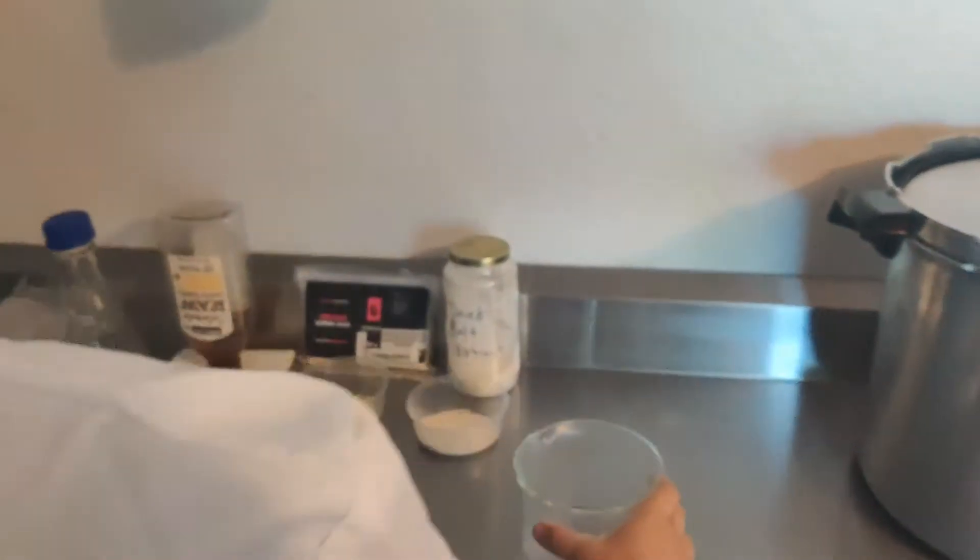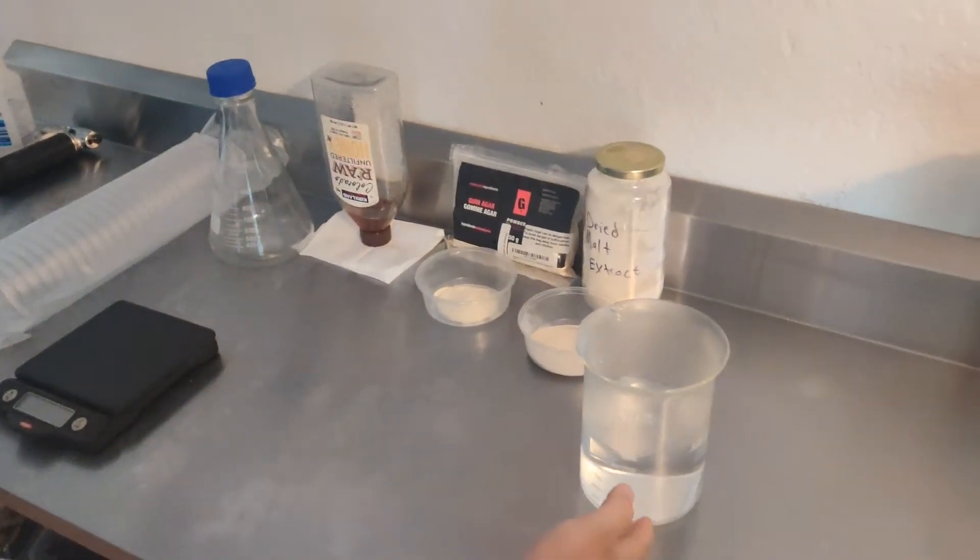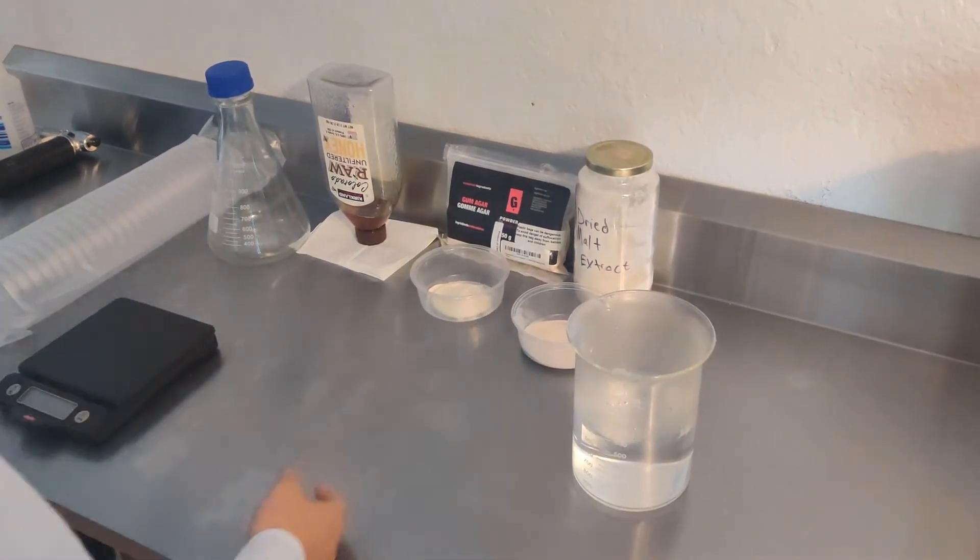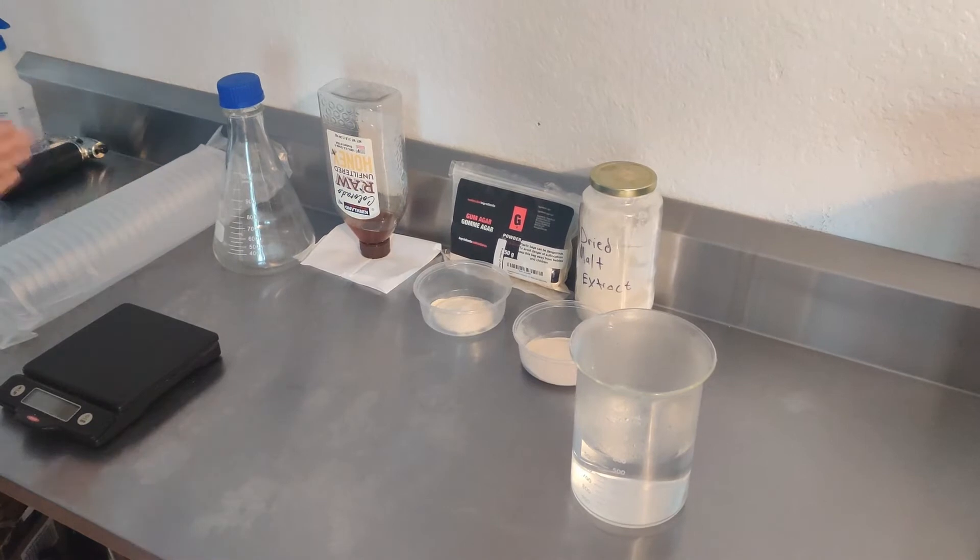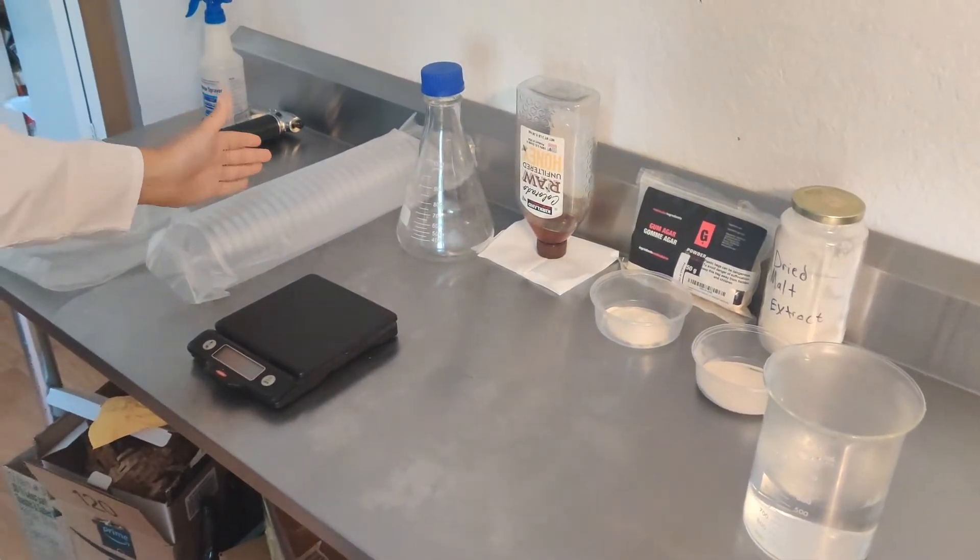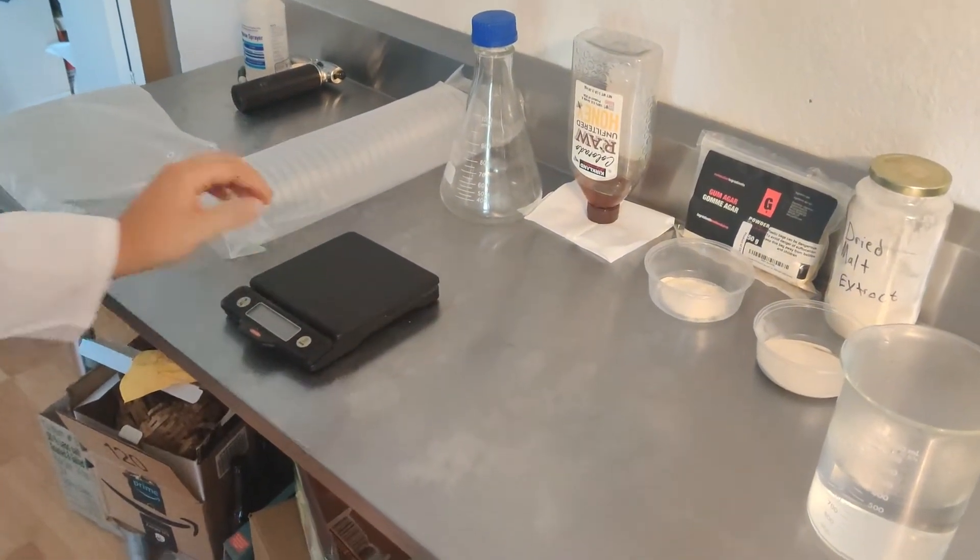Everything you'll need to pour agar is hot water, dried malt extract, agar powder, honey, an Erlenmeyer flask, sterile petri dishes, and a scale.